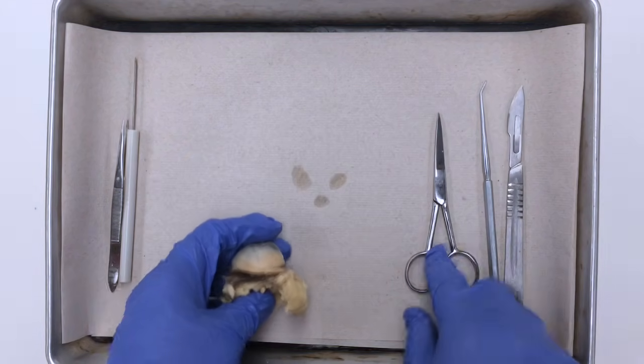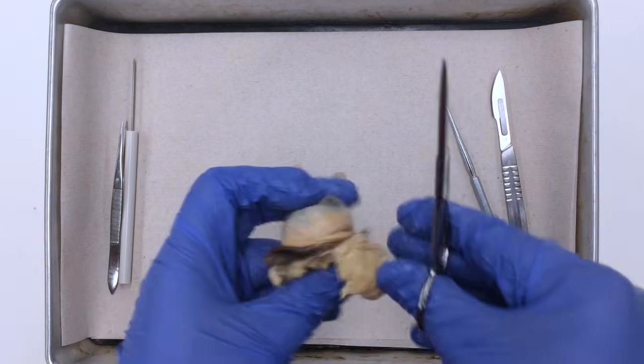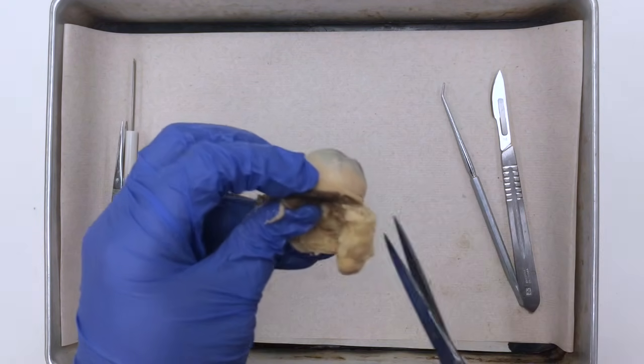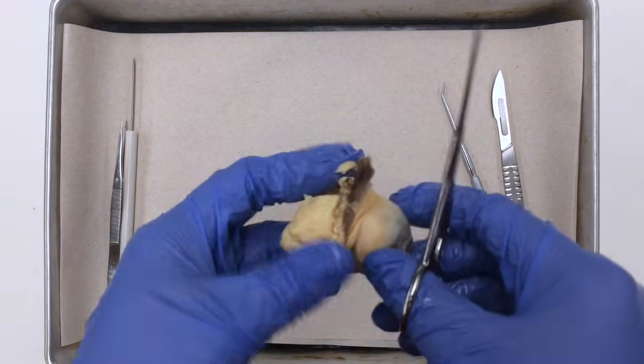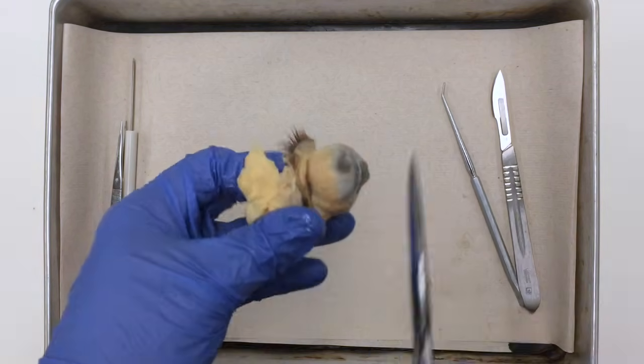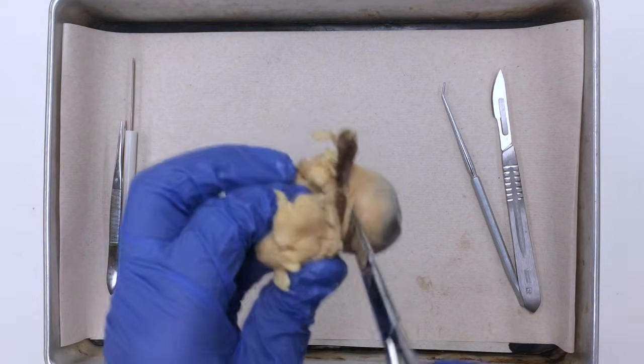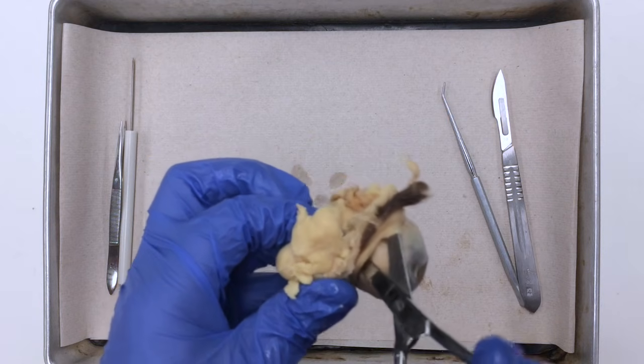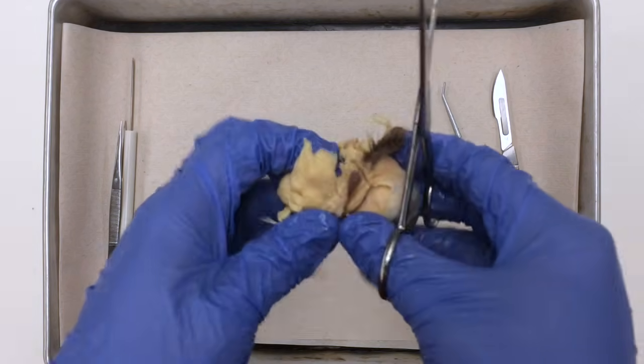Using the pair of scissors from our dissecting kit, the best way to do this is to cut superficially. Once you get into a structure, you can use the tip of the pair of scissors. You're going to insert, wiggle it around, and then open it up to spread the structures away from the eyeball. And then you can cut.